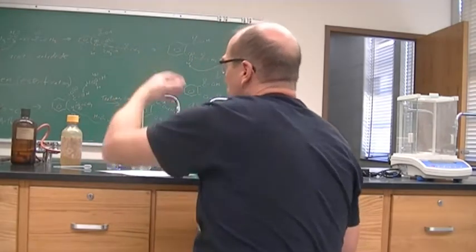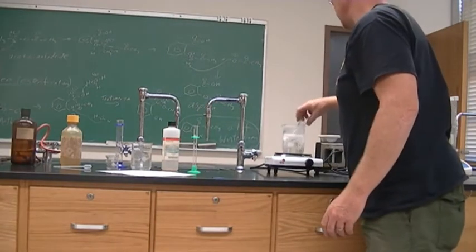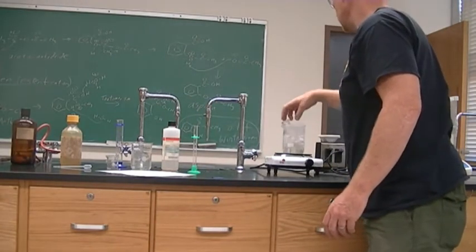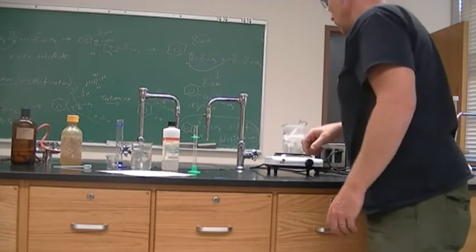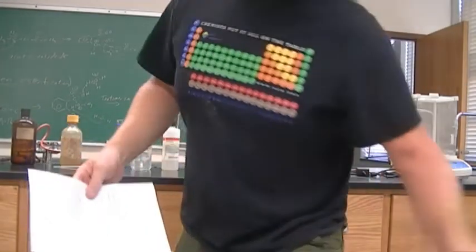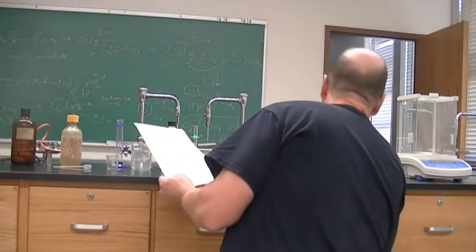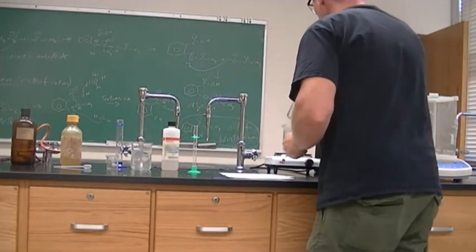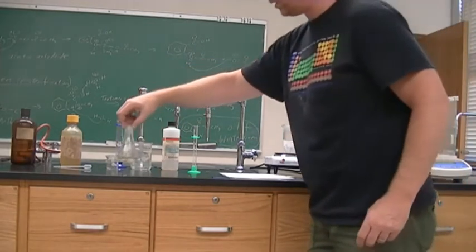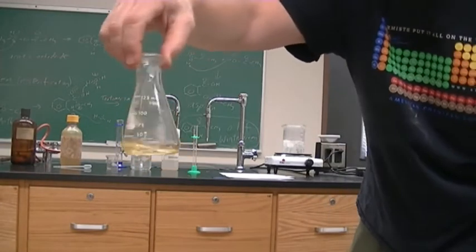But we do have the mechanism that I showed on the board. Alright, so oil of wintergreen is quite easy to make. A little methanol, some salicylic acid, and we've got oil of wintergreen. Alright, so that is still going on the aspirin, so we're going to put that until it all dissolves. This is quite warm. Alright, so it has all dissolved, so it didn't take 15 minutes to dissolve it. So there's no solid in there, it's all dissolved.